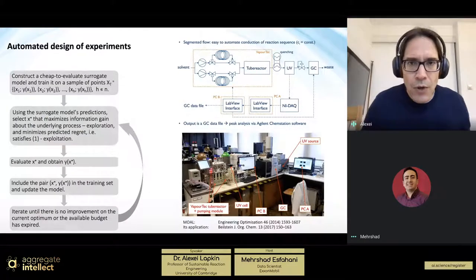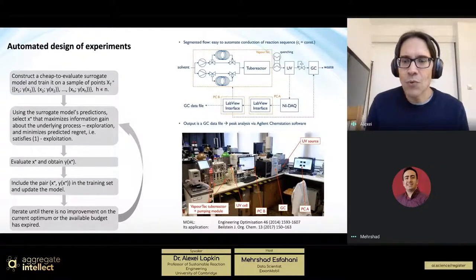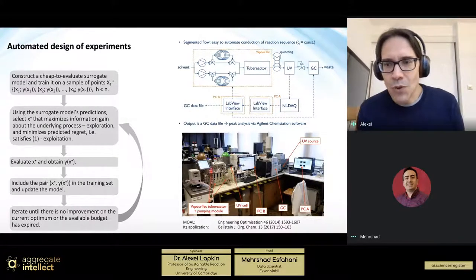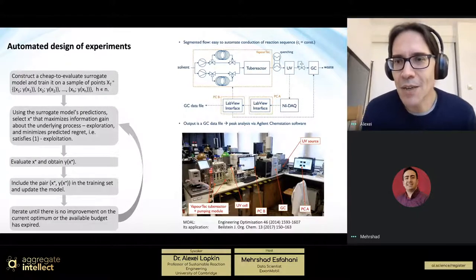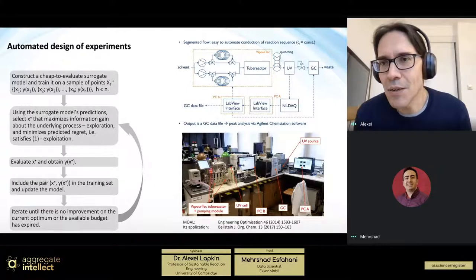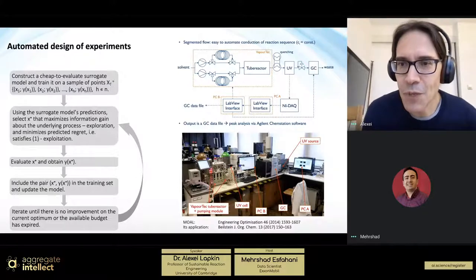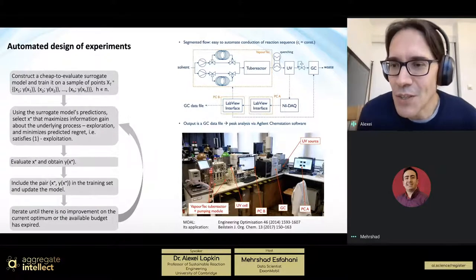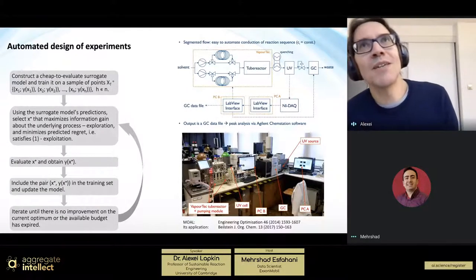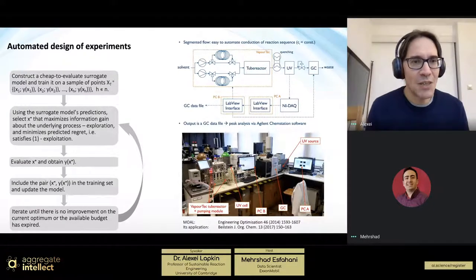So this is our current iteration. On this slide, I'll show you our first iteration of the same thing, which is in our old lab. It looks much more rugged than this, fewer boxes, but it still worked. We published it a few years ago. It's a very similar design. Again, the same Vapourtec machine, again sampling from line, but in this case using GC. And we used a very, I would say, ingenious way of running the GC by basically programming a mouse to click the run instead of doing anything else. That was the cheapest way of doing automation in this case.